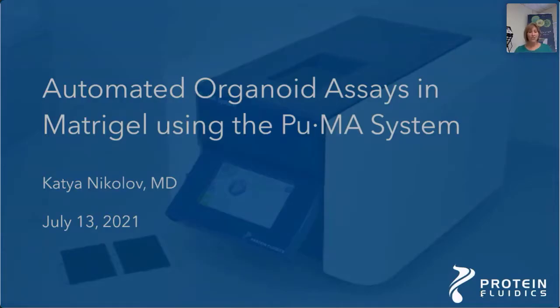Okay, well, thank you for the introduction, and thank you everyone for joining us at this webinar. Today, I will talk about automated organoid assays in Matrigel using the microfluidic-based PUMA system.